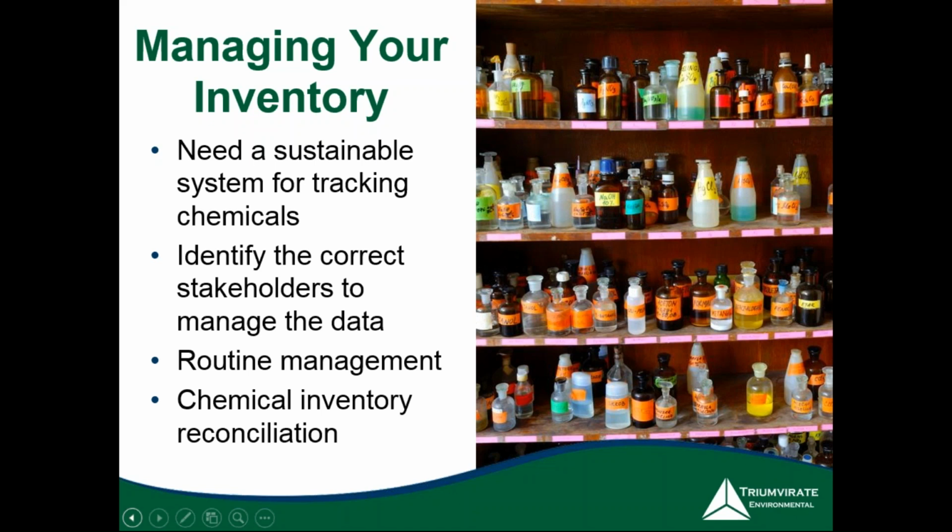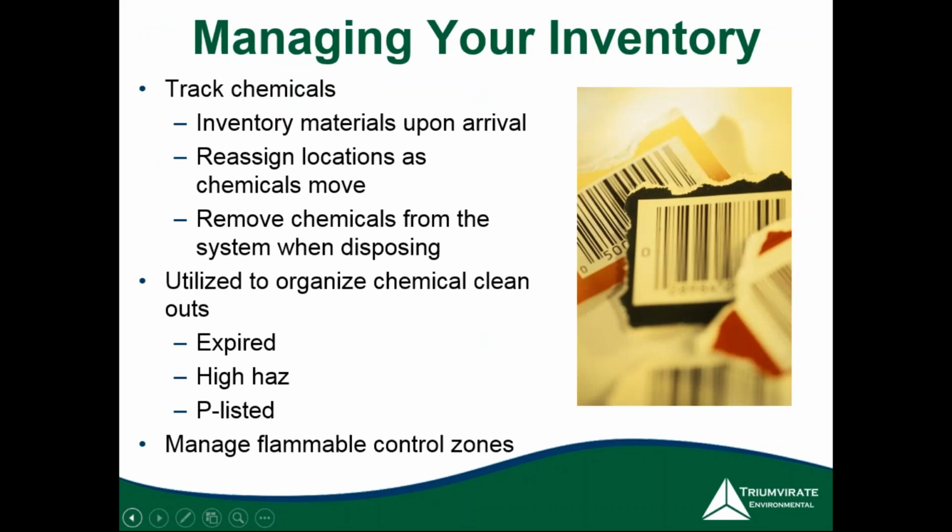We are dealing with potentially hazardous chemicals here, so having the proper safety training in place for those people handling this stuff is pretty important. Sometimes it can get overlooked when we're delegating tasks to different groups and don't necessarily know right away how much they're going to be involved or who's actually going to be handling what until the process gets going. So it's just important to assess that as you start and as you go.